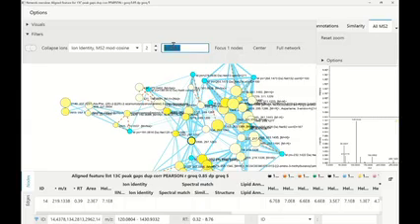Yes? I have another question. For measurement of small molecules, does the software provide bio IDs? When I want to extract the results and put them in statistical software, for this scenario you already have the statistical analysis section. Let's say I want to compare it with metabolomics. Does it provide any of the raw bio IDs like KEGG? Okay, so the question was whether other IDs are being provided.